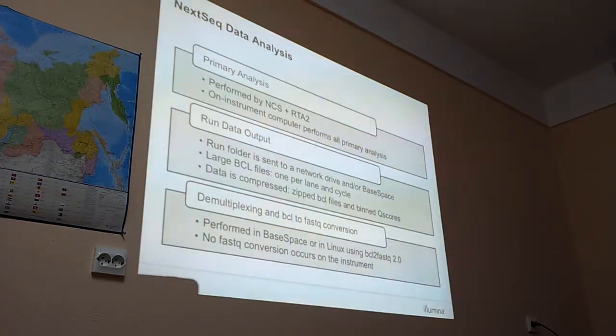We don't have a proper program for processing, and it is unknown when they will buy one. They haven't got a program for performing bioinformatic analysis of MiSeq run results. I hope that sooner or later they will buy it. They hope that they buy maybe CLC Bio. Okay. And now they cannot work with Unix programs for bioinformatics.